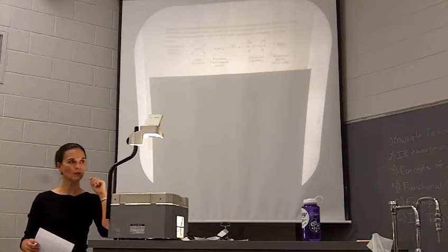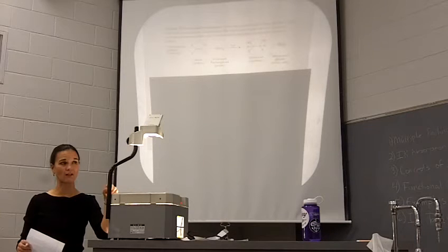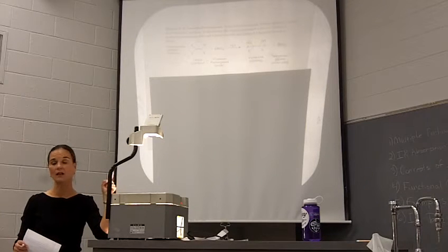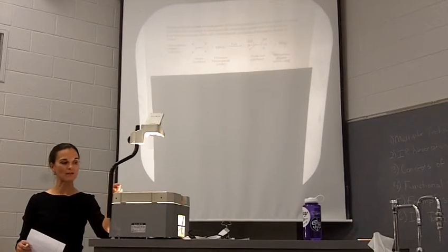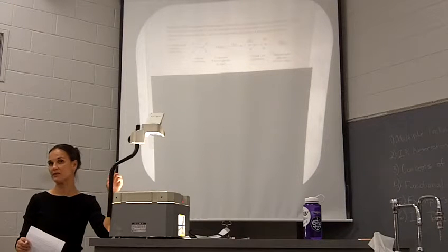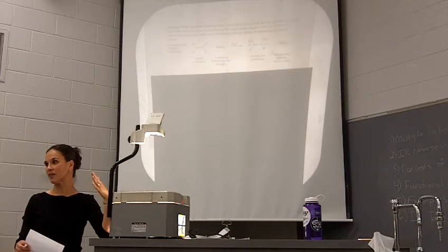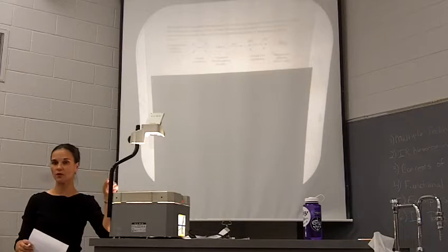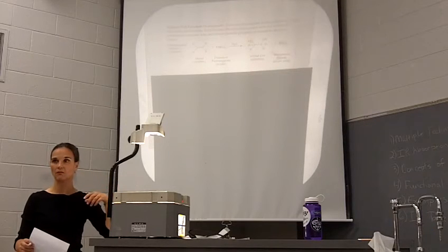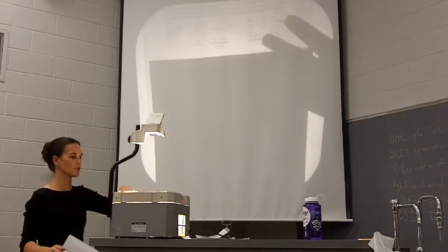So going back to the bromine test, is it reacting with an alkene or is it reacting with an alkane? If you have a positive bromine test and you have a positive potassium permanganate test, most likely you have an alkene, even if that bromine test gave you a little bit of acidic pH paper. So that's why I was saying, don't bank everything on the pH paper. Okay? Use your other results to help you figure out what's going on there. Okay? So those are the first of the two tests.